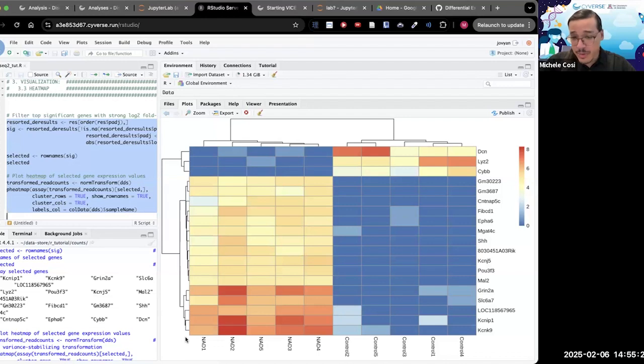samples. And from what I can see here, NAD2 may have some, or these genes here may have something to do in NAD2's treatment. So maybe it is time for us to look into these genes and see if we knock them out, something during a different experiment involving NAD2 will change.